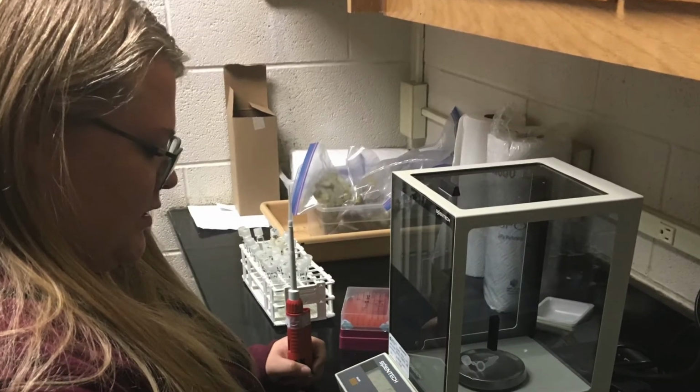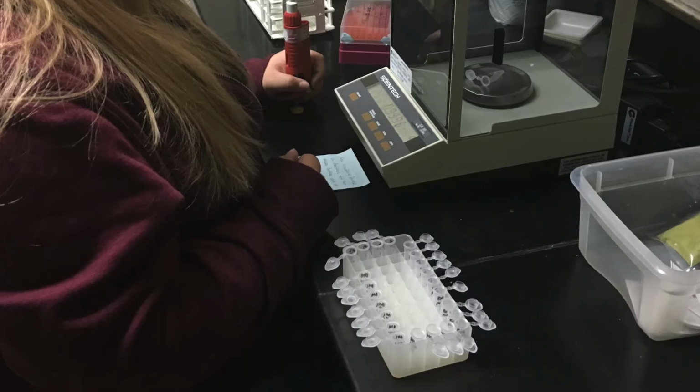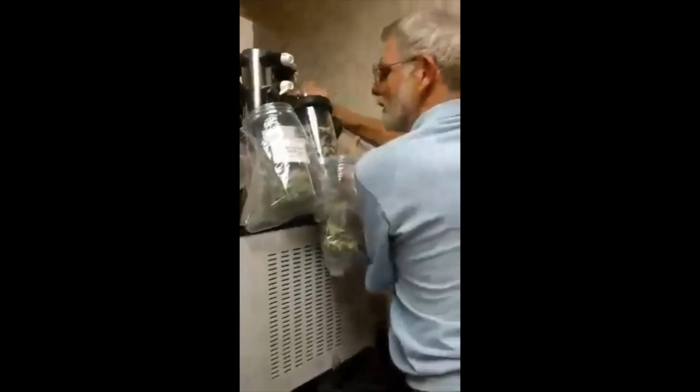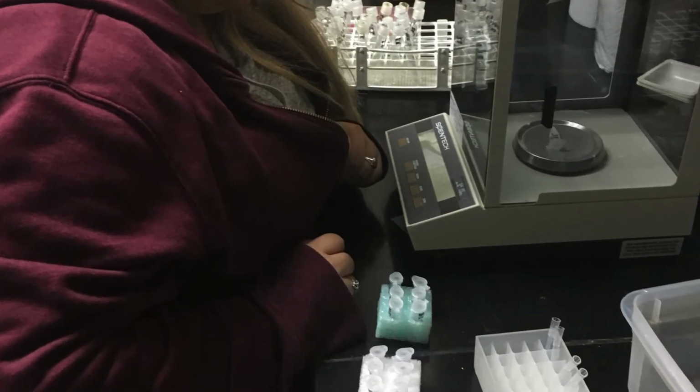We rehydrated the samples using sterile water and moved them to microcentrifuge tubes to obtain their wet weight. We centrifuged the tubes, removed the liquid, and freeze-dried the pellets. We stored the pellets at negative 80 degrees Celsius until we were ready to take the dry weight. We then measured the tubes to be able to calculate the dry weight of the pellets.